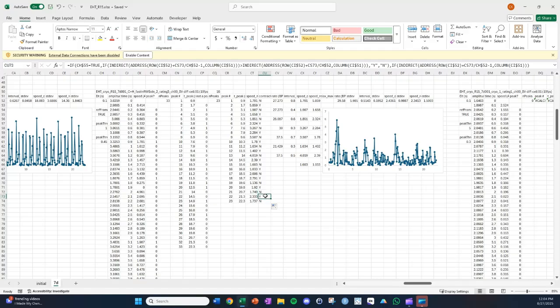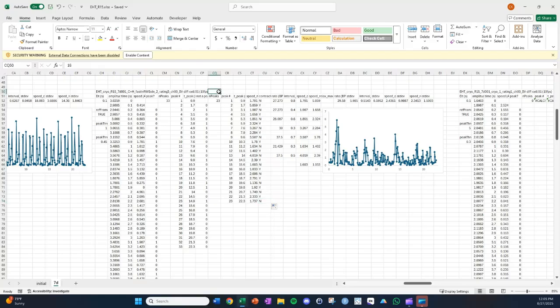and 21.3. Does that make any sense? So 20.7 would be there. 21.3 would be there, so that makes enough sense to me. And it's picking up this final peak as a relaxation peak there. So all of this, I think, is analyzed. I figured there are about 8 beats here.